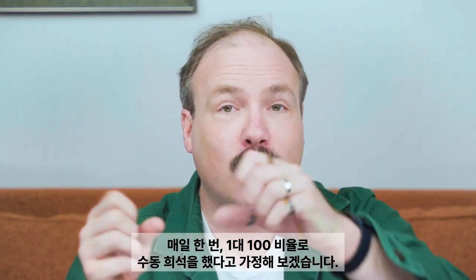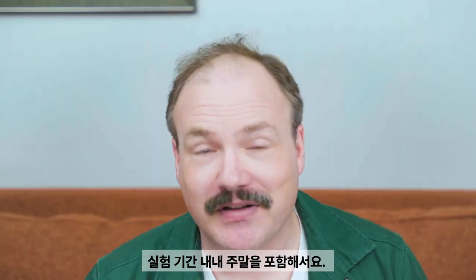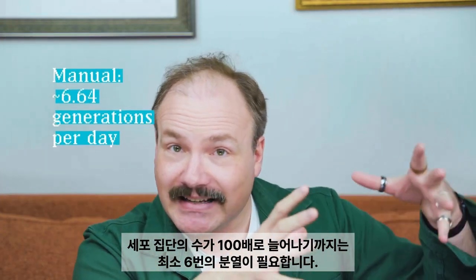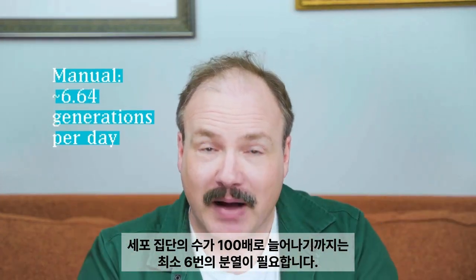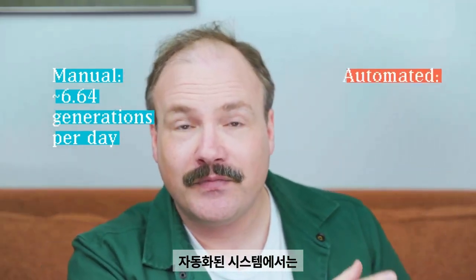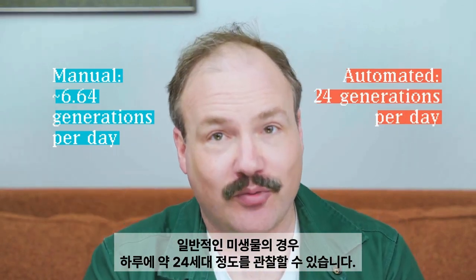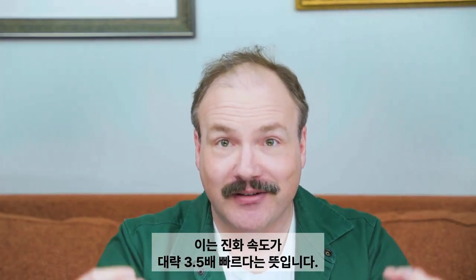Let's say, for example, you did a manual dilution of 1 to 100 every day, including weekends, for the duration of the experiment. It takes a little more than 6 divisions for the cell population to increase by a factor of 100. In the automated system, we might see 24 generations per day for a typical microbe. That's about 3.5 times faster evolution.